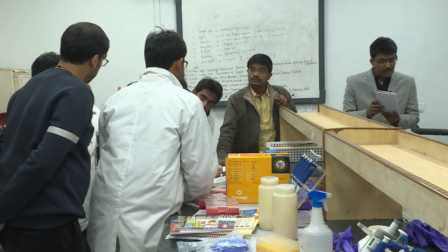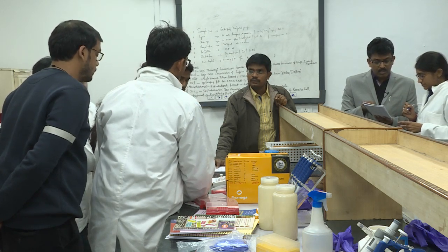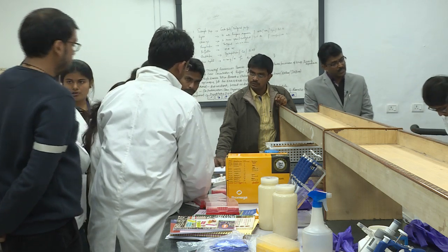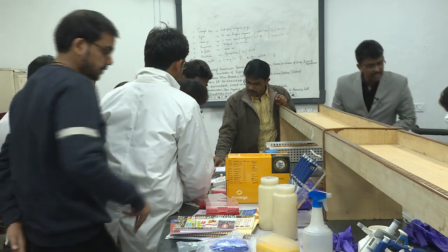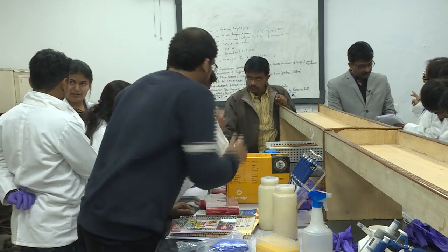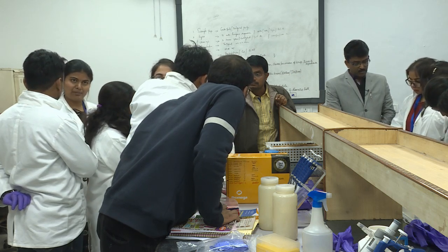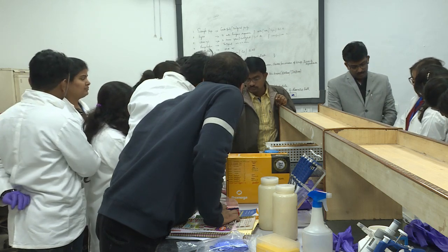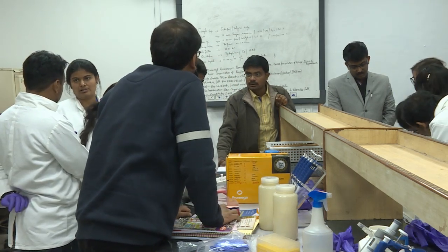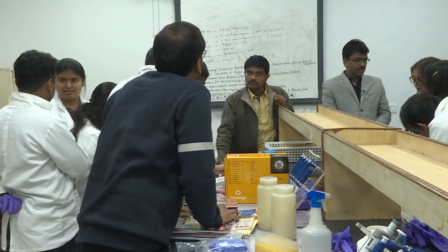Okay. Now we just calculate for 100 nanograms concentration. You just calculate. Okay, stock तो बनाते हैं 100, फिर उसको... Or you can go for 200 also because you have a good reading. Sir, the buffer which we are using, it will be the same buffer? Same buffer which we extracted our DNA, exactly. Yeah, true, sir. Last buffer. Yeah. Sir, one thing I didn't understand: yesterday you told me about this thing, that we use 10:1, and after that if DNA is less in amount, then what's the logic behind it? Yeah, we'll discuss the PCR, na? We sum up today.